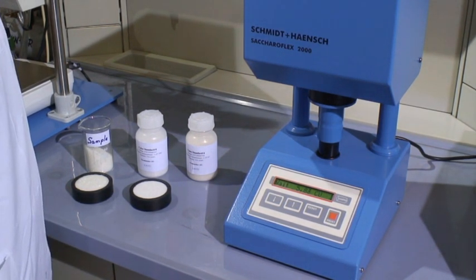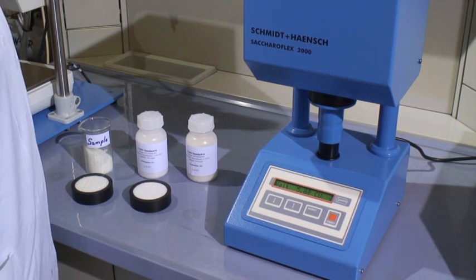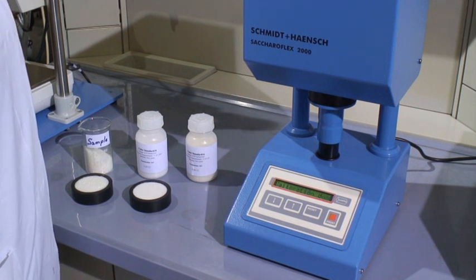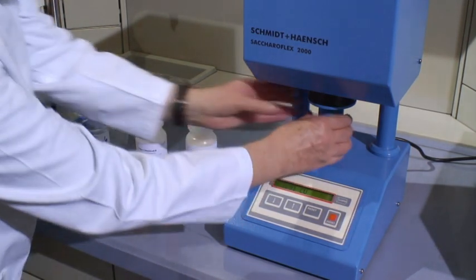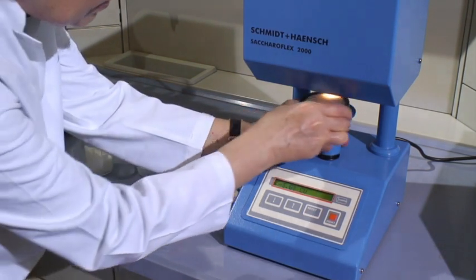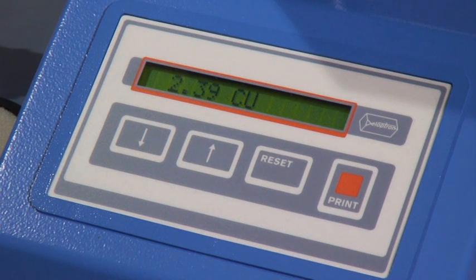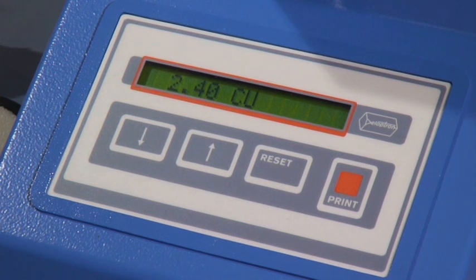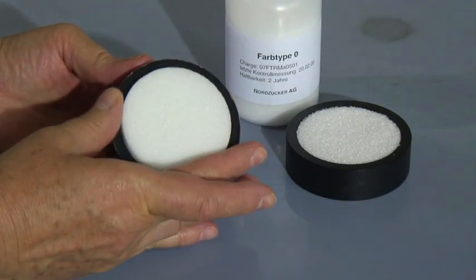After this calibration procedure, an unlimited number of white sugar samples can be measured directly one after another. The verification of the scale's endpoints can be repeated by the laboratory's specialised staff as often as required. It should be noted that the measurement of white sugar crystals is a complex measurement which takes into account glance, particle size, as well as the colour. It reproduces the colour perception of the human eye, which composes the colour impression from different sources. We are consequently not talking about a simple colour value, but about an empirical scale which is in accordance with the perception of the human eye. Accordingly, ICUMSA has determined the ratio values of 495 and 620 nanometres that reproduce this colour impression best. An additional ICUMSA colour standard is presently being examined, and we hope to be able to supply you another standard soon.